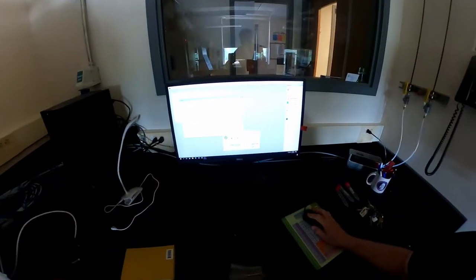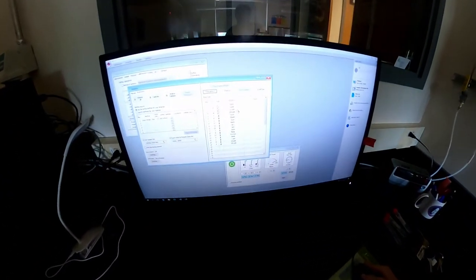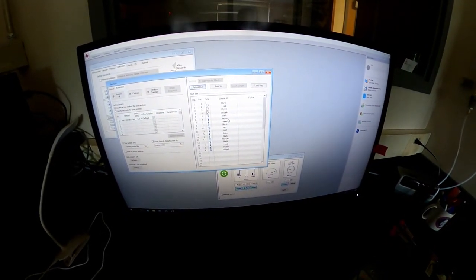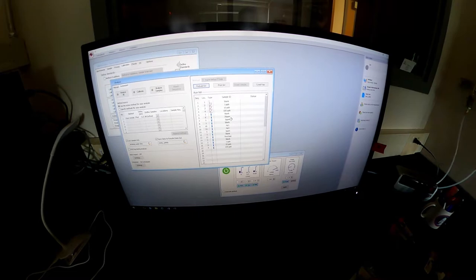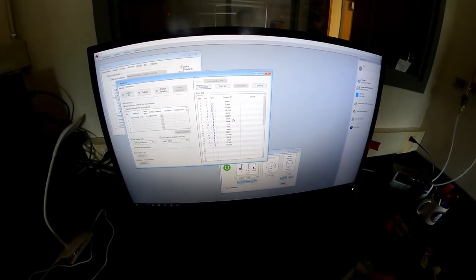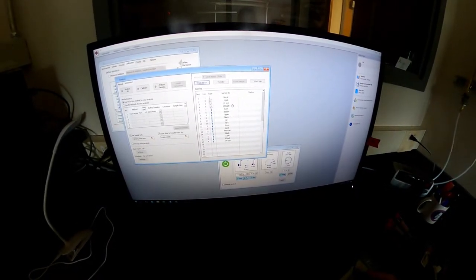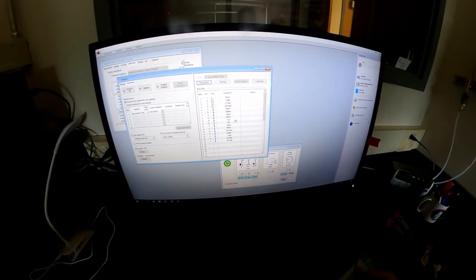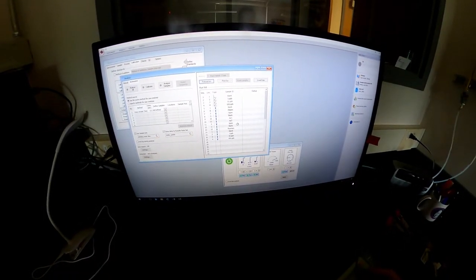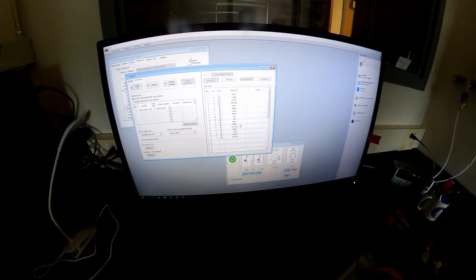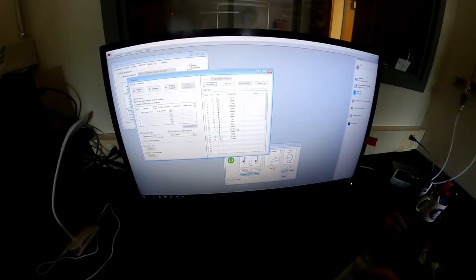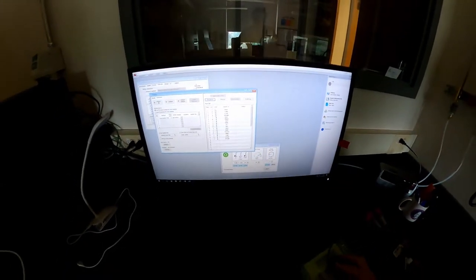Today we're going to calibrate with a blank, a one, a 10, and a 100 PPB. Then we're going to run the blank, a 20 and a five. Those should read PPB. I should go fix those. They're not correct. And then we're going to run the blank again. So we're going to make sure that we get good analyses on things we know. Then we're going to run Nico samples, run the five again and the blank again, just to check. And then we'll run the fountain and come back, run the blank and close with the rest of our standards. So we'll give this a shot, see if it works.